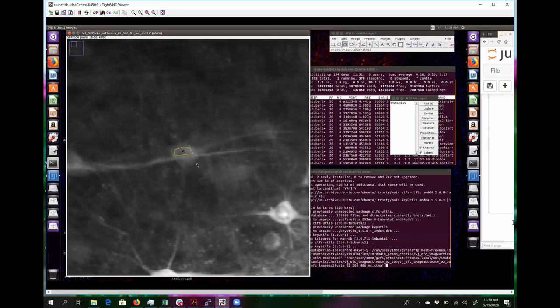So if you want to know what the shape of the cells are, and maybe where the true centroid of that cell is and stuff like that, then that's not going to work here because your ROI is actually not going to cover the whole cell. Yeah. But I think for the sake of just getting the functional time series, this is probably the best way. Exactly.